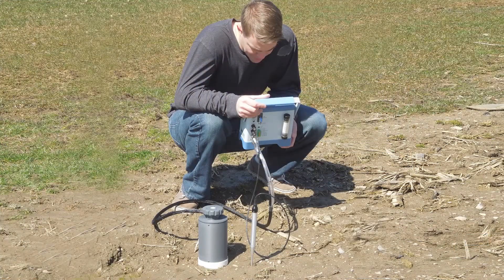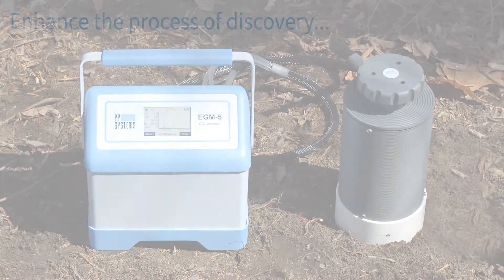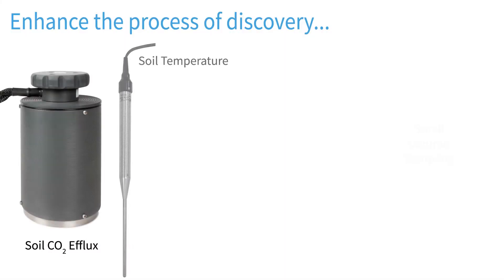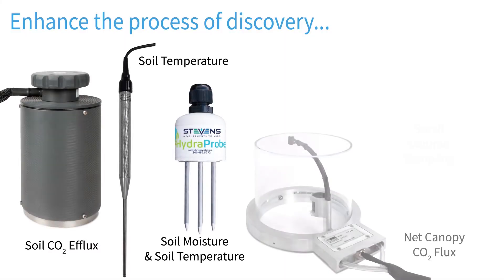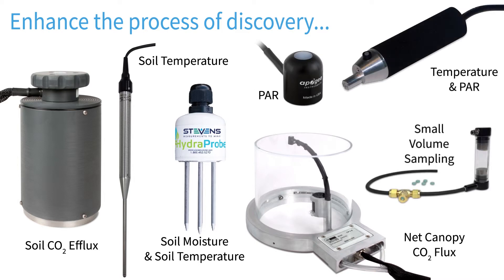The compact and lightweight EGM-5 utilizes our AutoZero technology to ensure fast warm-up and long-term stability, accuracy, and analyzer calibration. Highly versatile, the EGM-5 offers multiple plug-and-play accessories to expand its measurement capabilities and enhance the process of discovery.